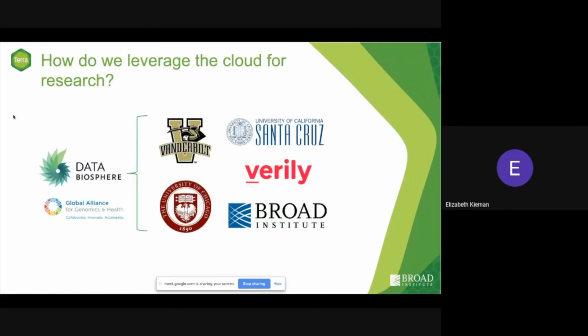So how do we leverage the cloud to solve these problems? These institutions came together and laid out a vision for what they refer to as the data biosphere, which is kind of like a vibrant ecosystem of all of these data repositories and the code to handle them. And everything is designed to be in accordance with standards laid out by the Global Alliance for Genomics and Health.